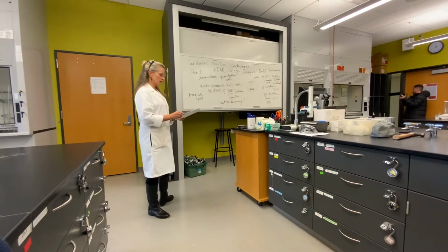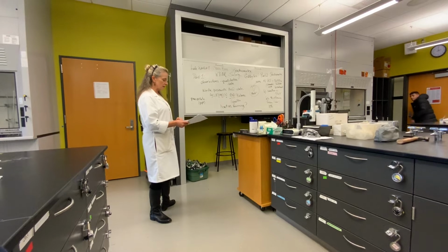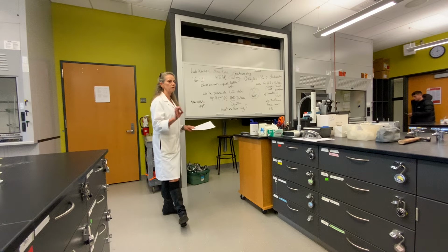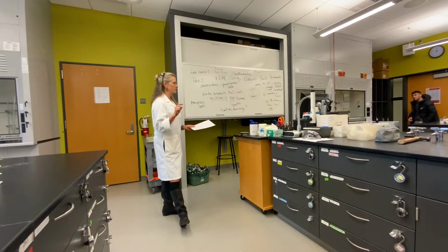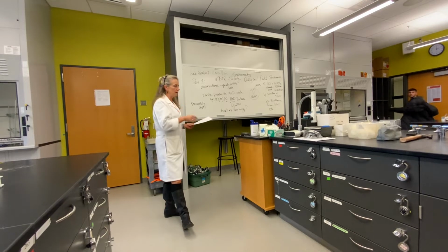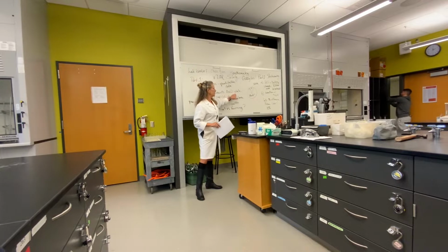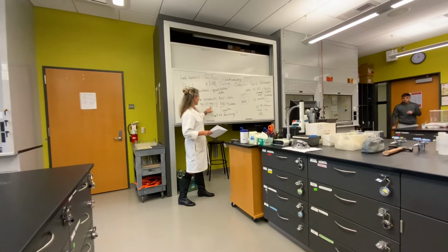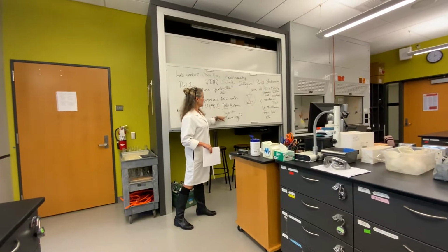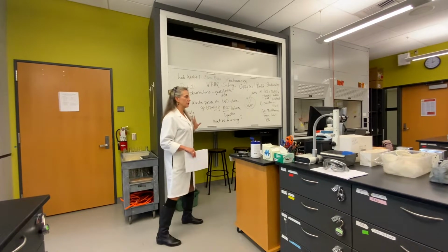So if you guys will look at your front page, you'll see that there's directions for all 7 reactions, and included in those directions are the reagents or the reactants and the type of reaction it is. So basically we've done half the reaction for you, okay? And so you guys are going to write the products and the state, and I'll remind you that states can be gas, liquid, aqueous, or solid, okay? And then I want you to balance the equation, all right? So that's the big thing that you're doing in this part.